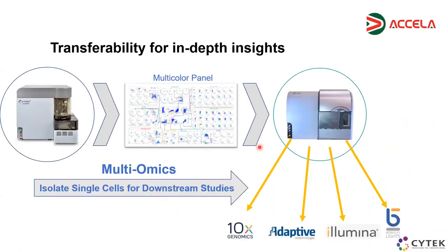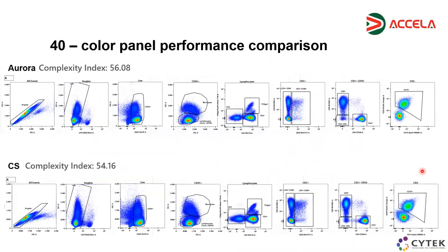And we also have the way to go with high purity single cell sorting and do some post-processing, for example, sequencing or single cell analysis with some other type of technology. So you can set up your pressure level and your nozzle type in a way that you keep your cells quite viable, so that you can perform some post analysis omics in isolated single cells.